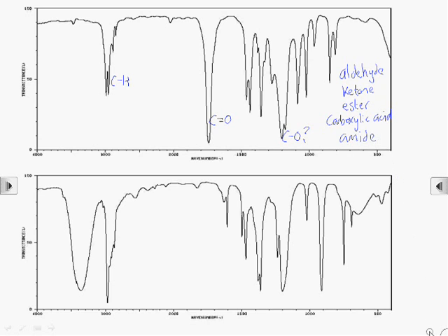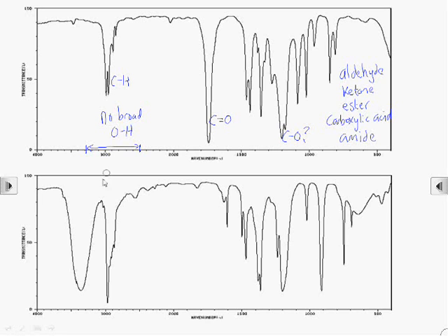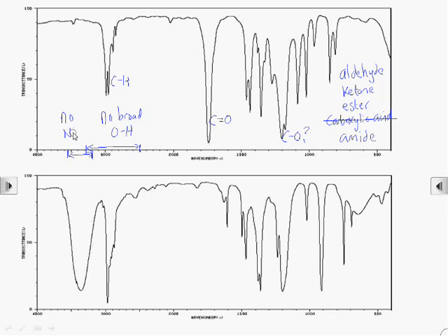Identifying is also about noting which absorptions are not present. If this were a carboxylic acid, we'd expect a large, broad absorption somewhere in this region. And since there's no broad absorption here, there's no oxygen-to-hydrogen bond present, and so it's not a carboxylic acid. For an amide, we'd expect an NH stretching vibration somewhere in this region. And that's not present either, so we can also rule out this being an amide.